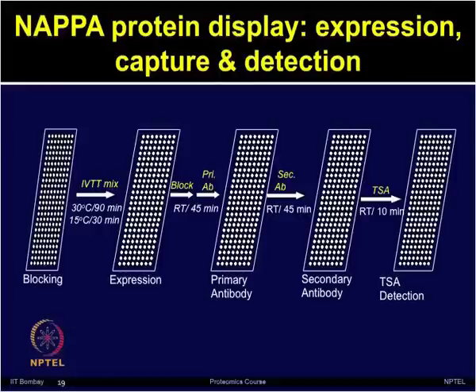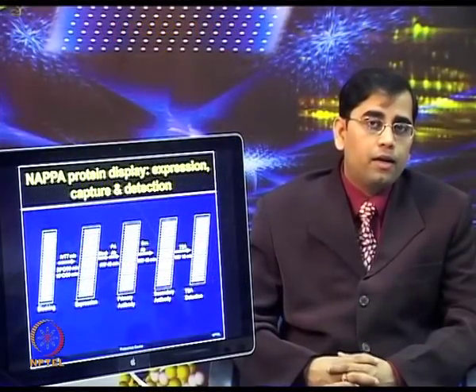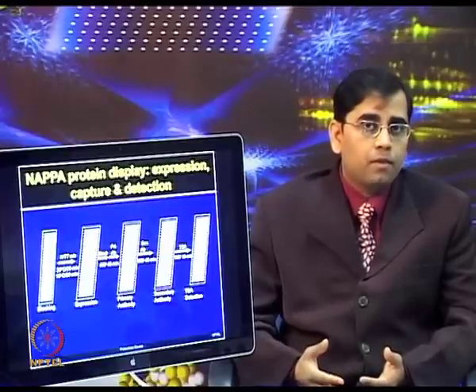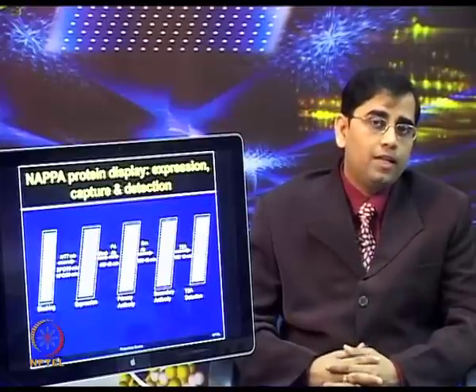Again, you can add milk in PBS or BSA. Once this blocking is done at room temperature, then the primary antibody can be added. If your experimental aim is to just do the quality control check of protein expression, you can use anti-GST antibody, or if your aim is to look for certain autoantibody markers, then at this stage one can use serum from various patients. Once this incubation is done, then the corresponding secondary antibodies can be used.